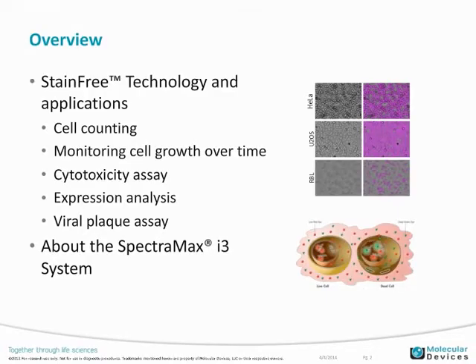Today's presentation covers the StainFree technology and applications, including cell counting, monitoring cell growth over time, cytotoxicity assays, expression analysis, and viral plaque assays. We'll also discuss the SpectraMax i3 multimode system.